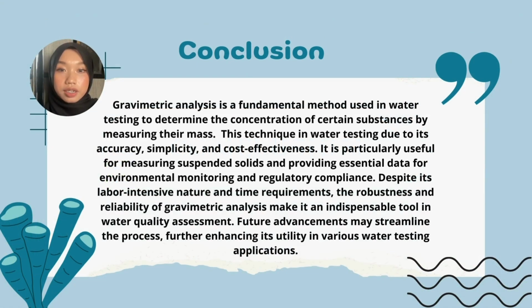For conclusion, gravimetric analysis is a fundamental method used in water testing to determine the concentration of certain substances by measuring their mass. Due to its accuracy, simplicity, and cost effectiveness, this technique is particularly useful for measuring suspended solids and providing essential data for environmental monitoring and regulatory compliance.